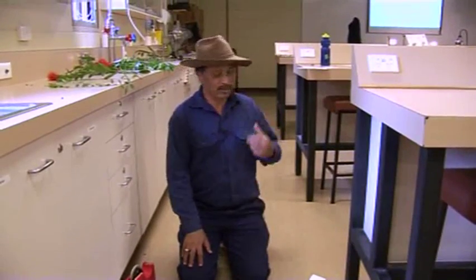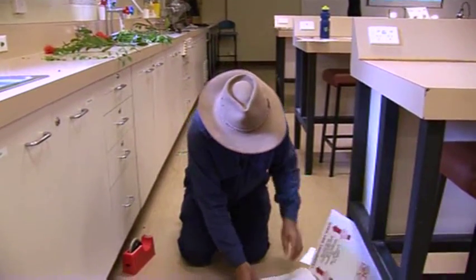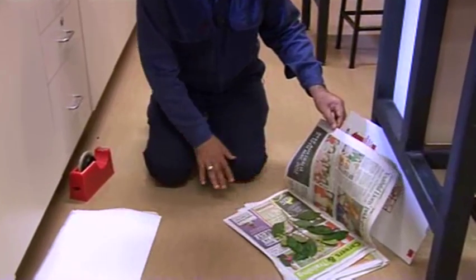We're moving into the second step, that is curating the samples. We've already collected the samples here from the field. We have pressed them here. They're not dry yet, but at least that's the way they look like.